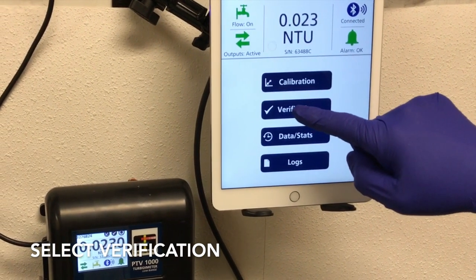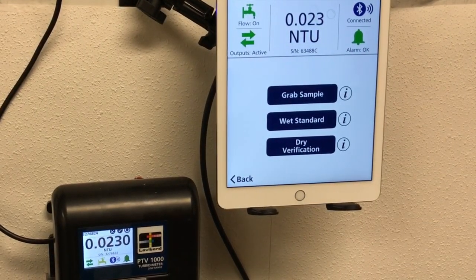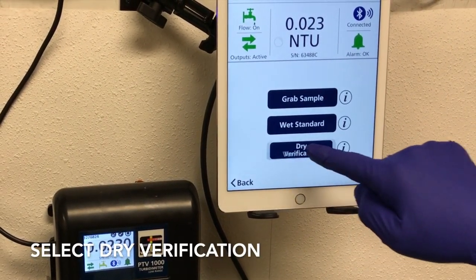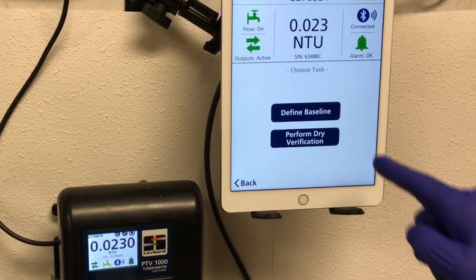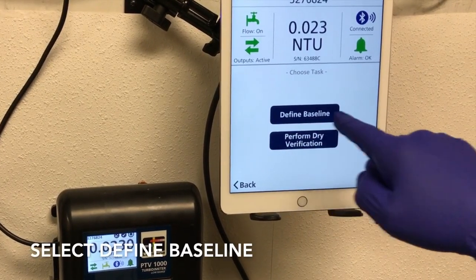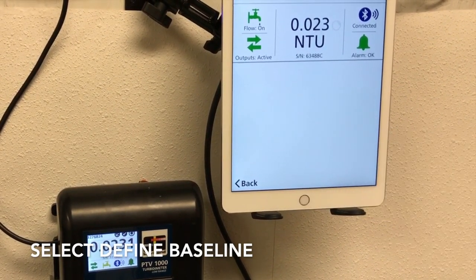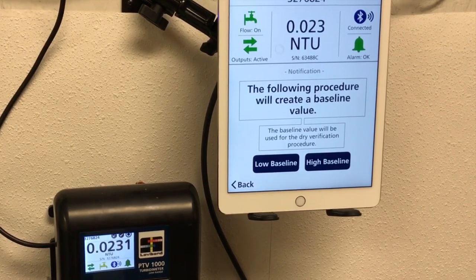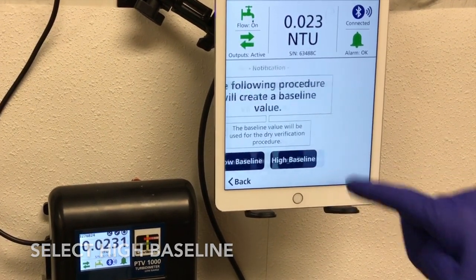To begin defining a baseline, press Verification, then Dry Verification. Pressing Define Baseline will allow you to select between a low baseline or a high baseline procedure. For this procedure, press High Baseline.